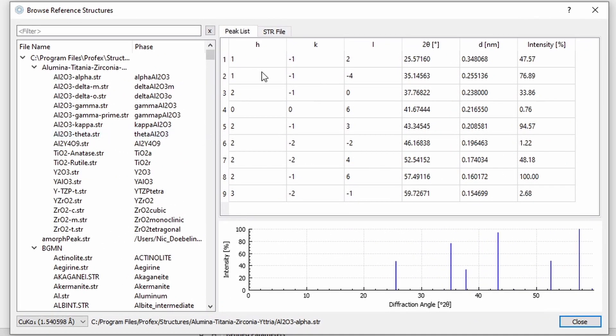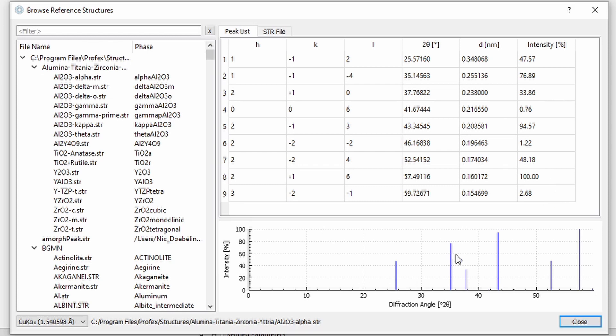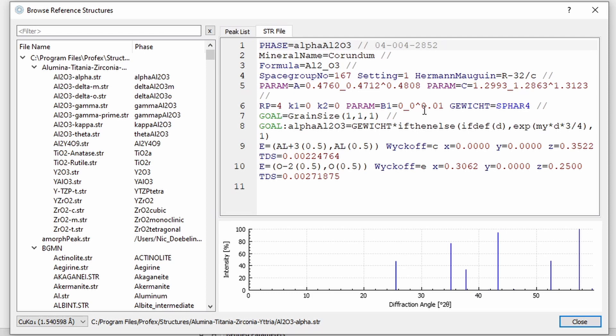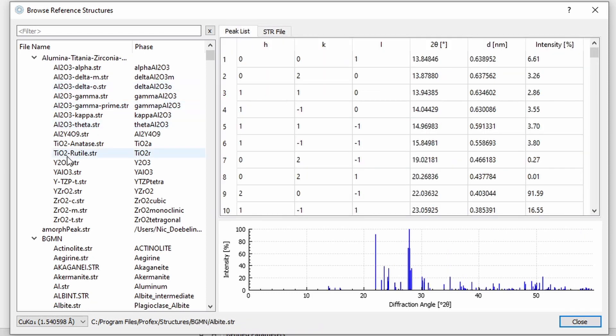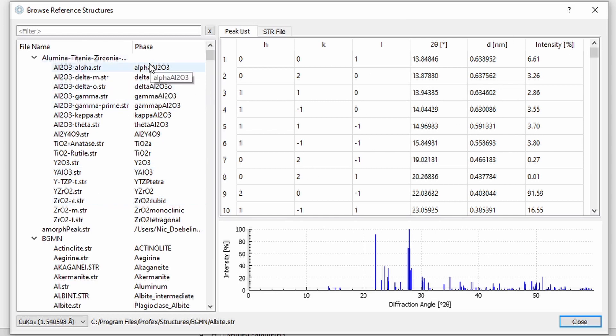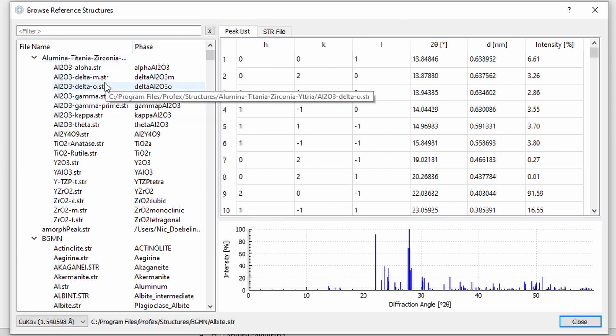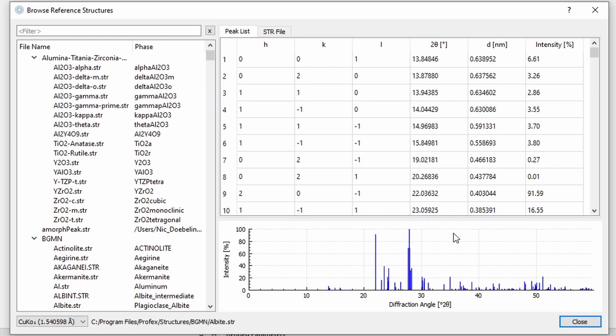Let's make this a bit bigger. It shows us the HKL indices, the 2 Theta position or the D value of the position, and the relative intensity, and also the stick pattern at the bottom. And we can also show the structure file for BGMN. And this is really all this dialog does. It only displays the content in the internal reference structure database.